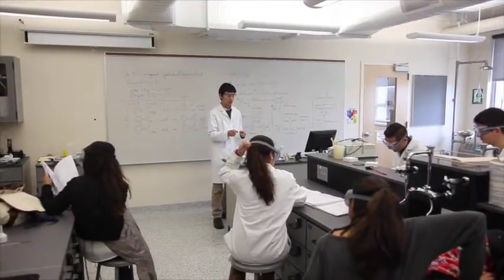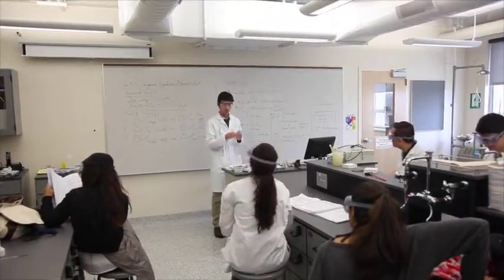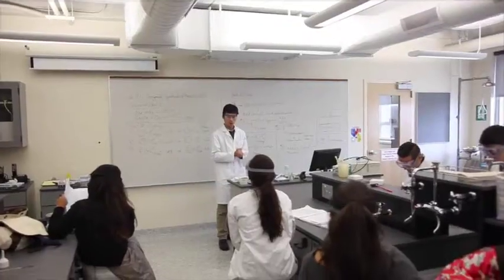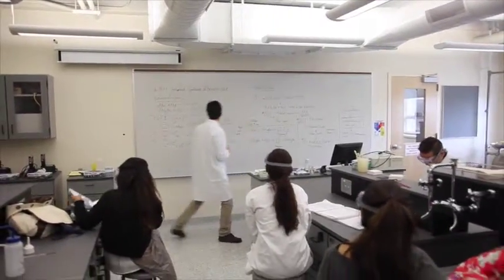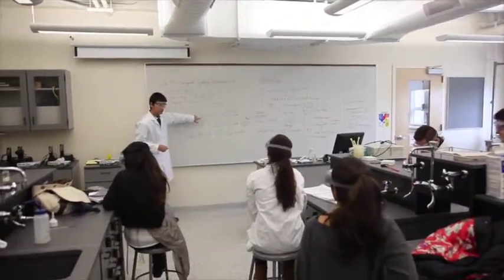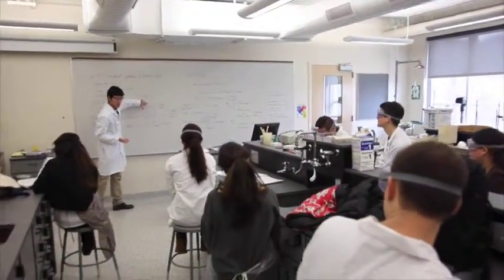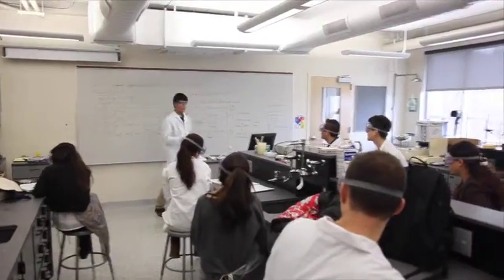So why do you need to add hydrochloric acid? Why do you need the hydrochloric acid? Go back to the equation. You're using hydrochloric acid, an acid solution, to make the benzoic acid, correct? The first step also needs some diethyl ether added inside.